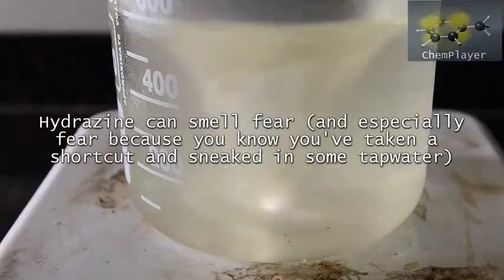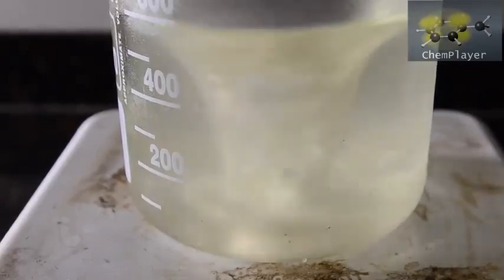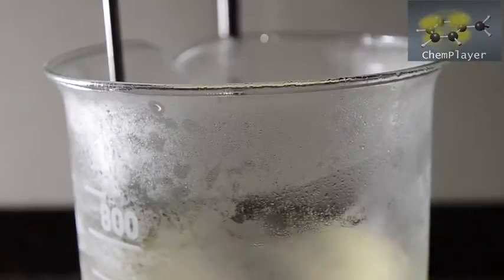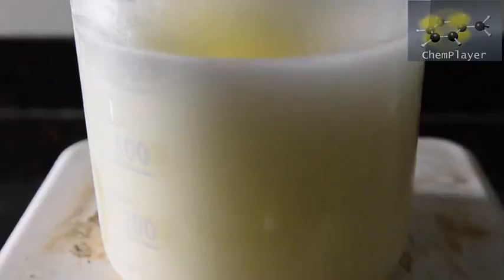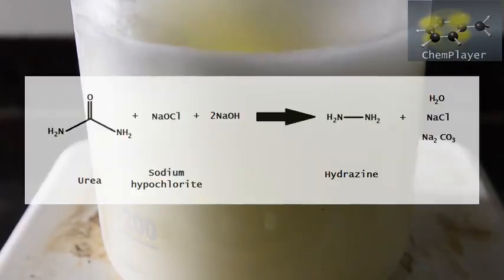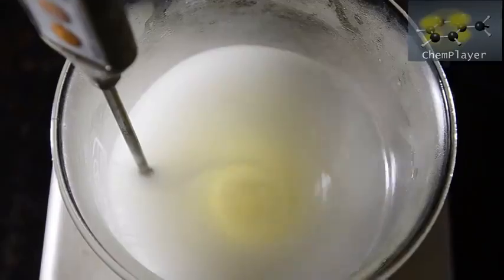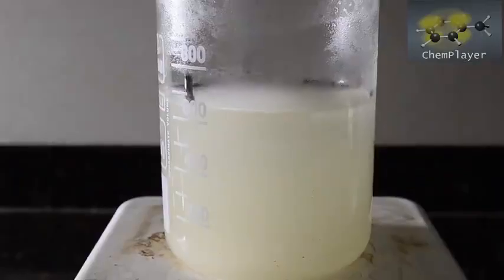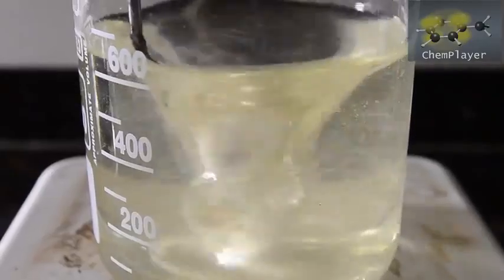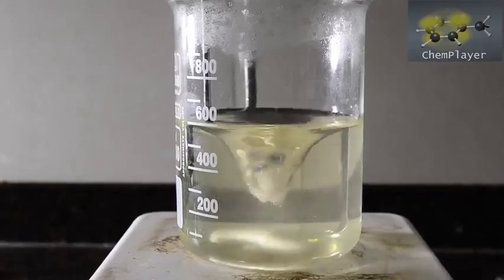Note that if you get no foam at all then your bleach is probably old and useless. Dial up the stirring to as high as you can for the reaction, and now in one go add the urea and gelatin solution. The mixture turns white as tiny bubbles of nitrogen gas are generated. Note that the foaming can be delayed, so don't get too cocky just yet. We've got some gentle foaming but not too much, which is great. The reaction has caused a slight temperature increase up to about 25 degrees C. Soon the gas production dies down and we obtain a clear solution again, which contains an intermediate compound that we now need to decompose in order to get our hydrazine.